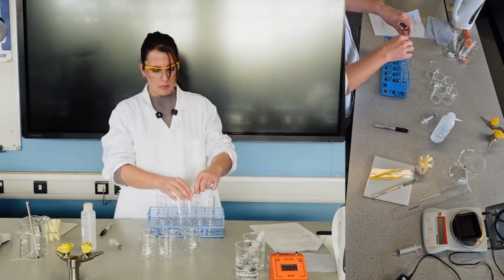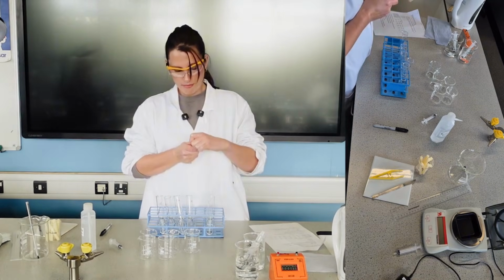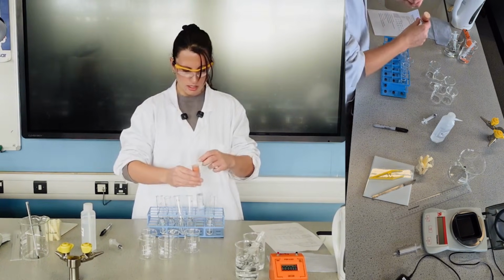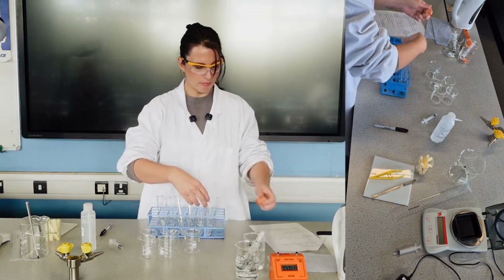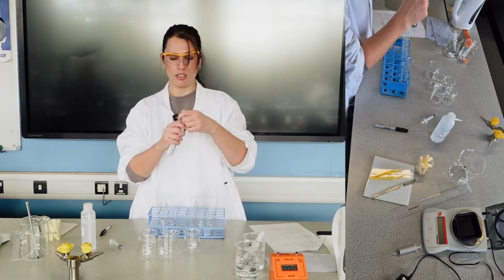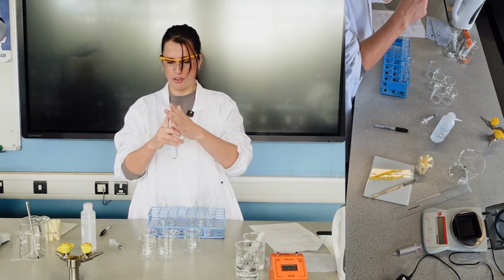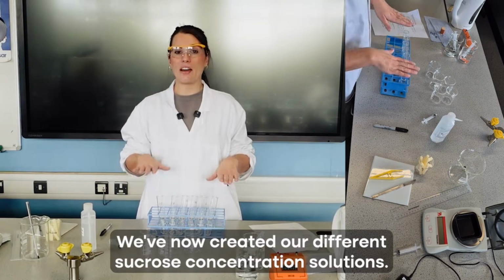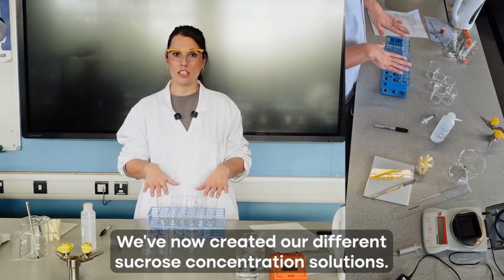So I've got all of those, but for each one, I'm just going to place the bung in and invert to make sure we do have that thoroughly mixed, so we have the concentration we're expecting. I'm just dabbing it each time to reduce transferring over any. So we've now created our different sucrose concentration solutions.